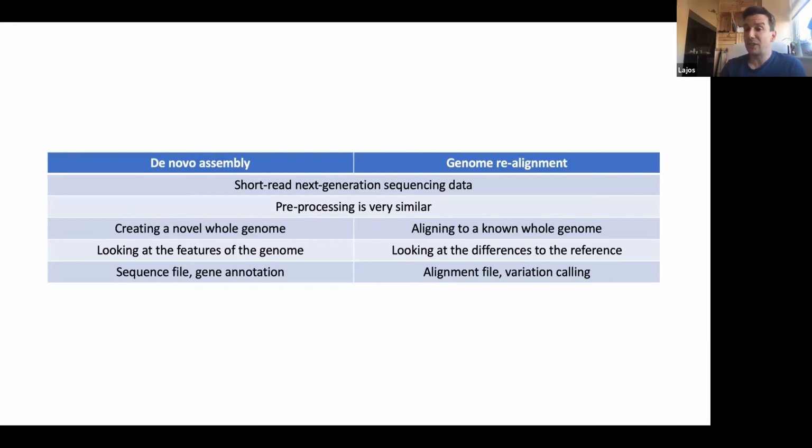or if you do some other biochemical or mass spec identification and you see that it's an E. coli, then you can use an E. coli reference genome. But of course, there are also several thousand different E. coli genomes, reference genomes. So that's about the input data.